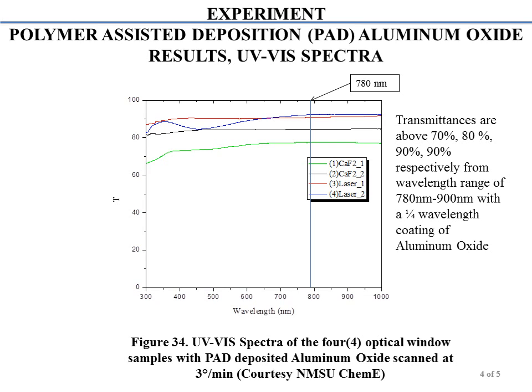This really shows a very high quality coating due to the high transmittance in the UV-vis using the deposition using the PAD technique.